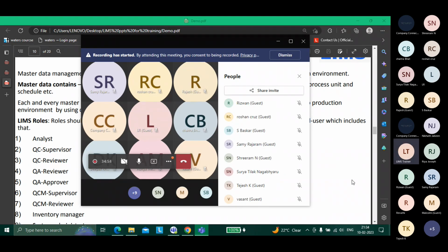So what are roles, right? From the front end, you can tell, okay, I'm an analyst, maybe I'll only be able to enter values for samples. For example, I don't know how things are set for each pharma company in the lab, but one person may be supervisor 1.